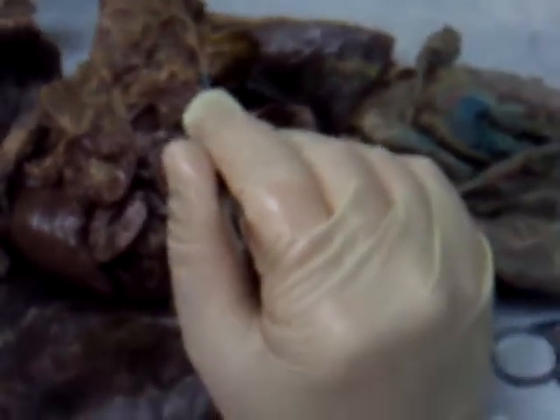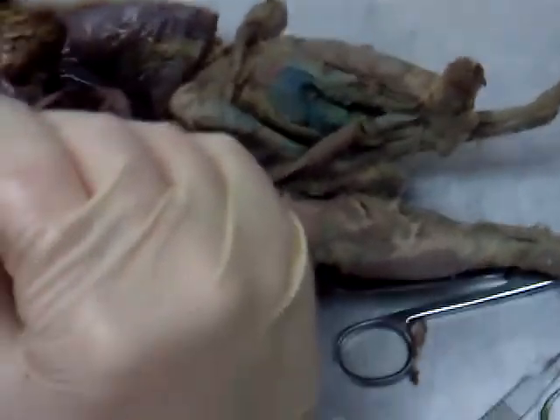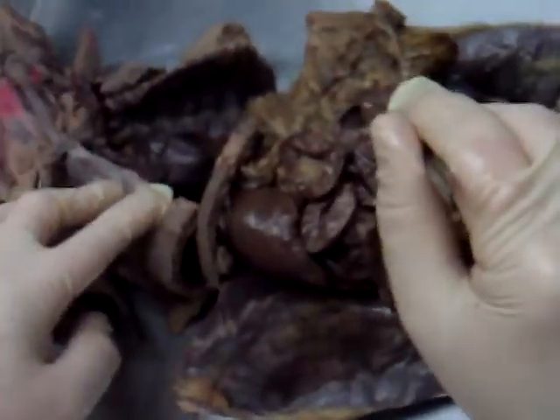Remember also on the brain: just two parts of the mink brain — the cerebrum and the cerebellum. On the models, which one do you have the most problem with? On the heart? Okay, we'll get the heart model out.